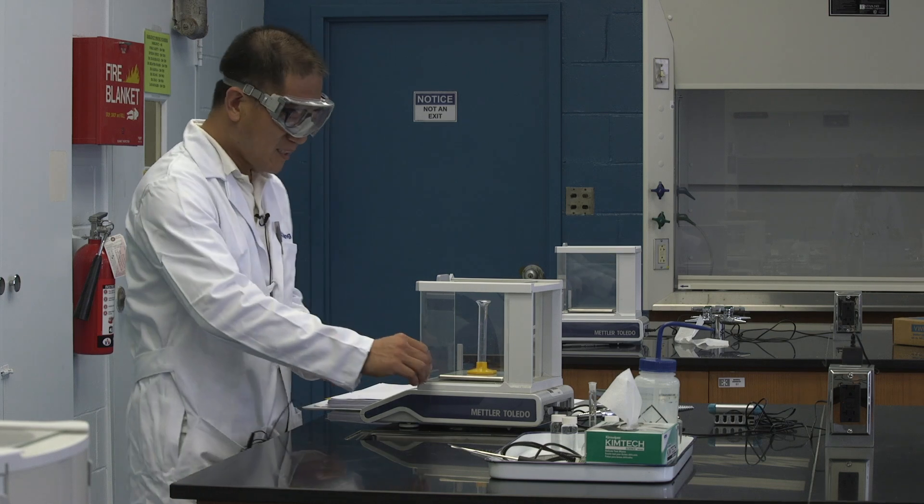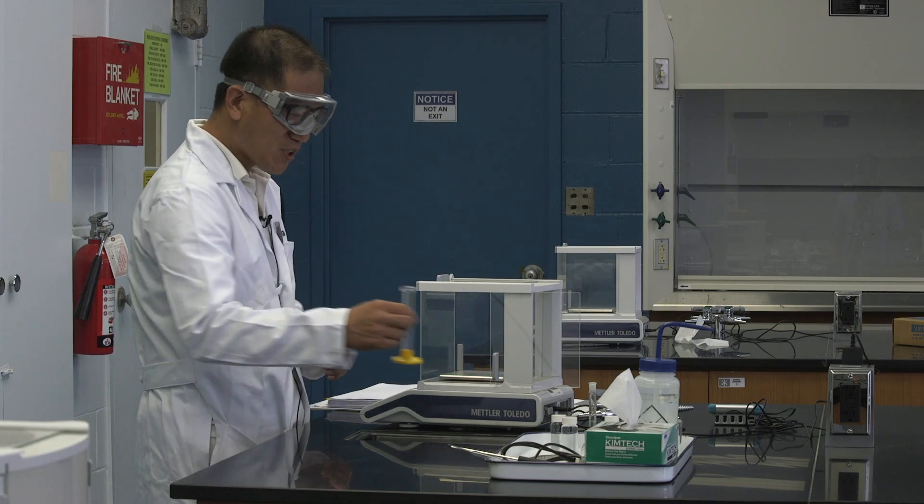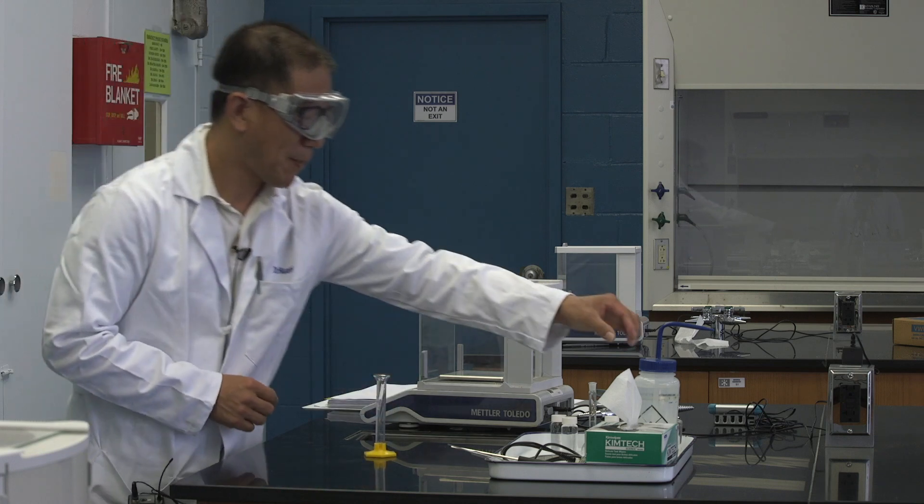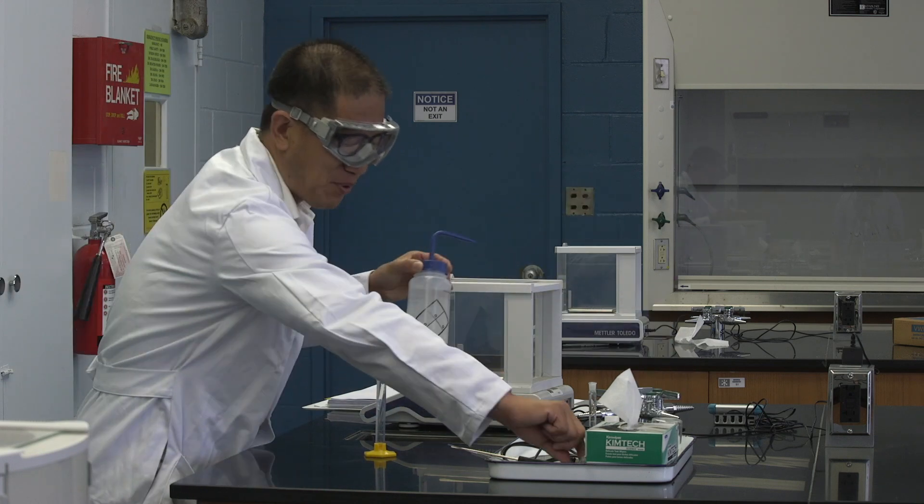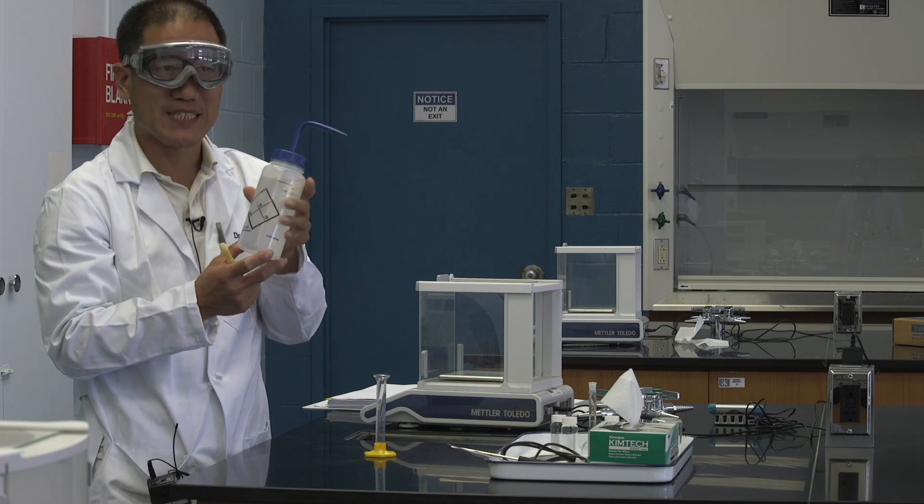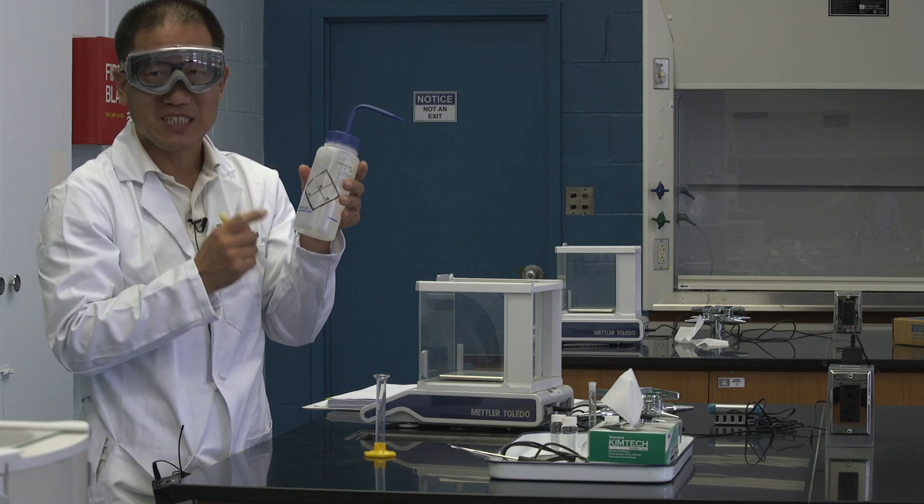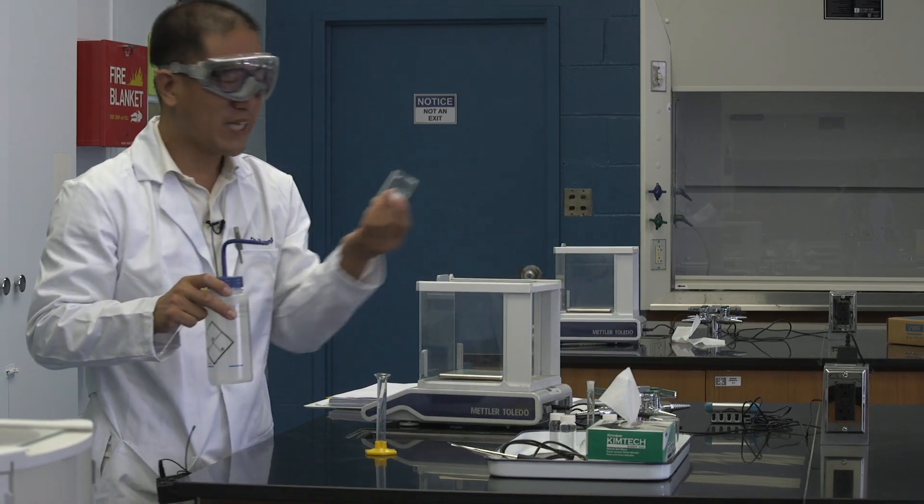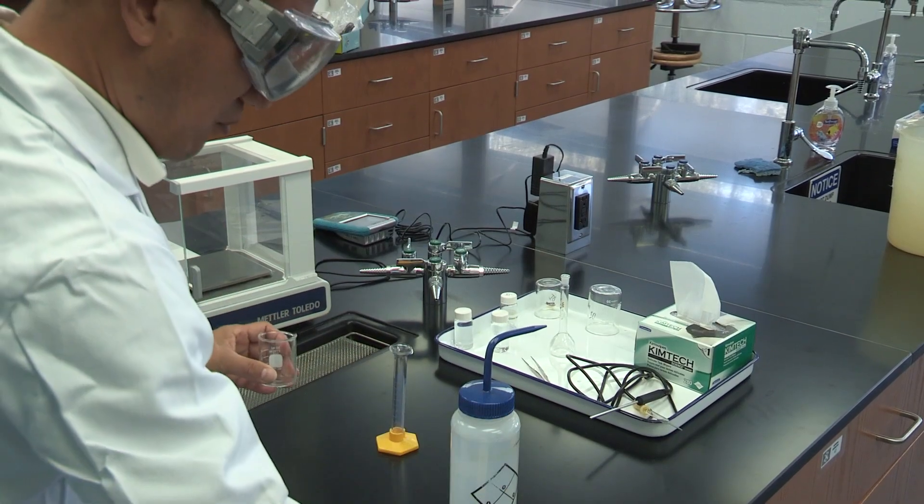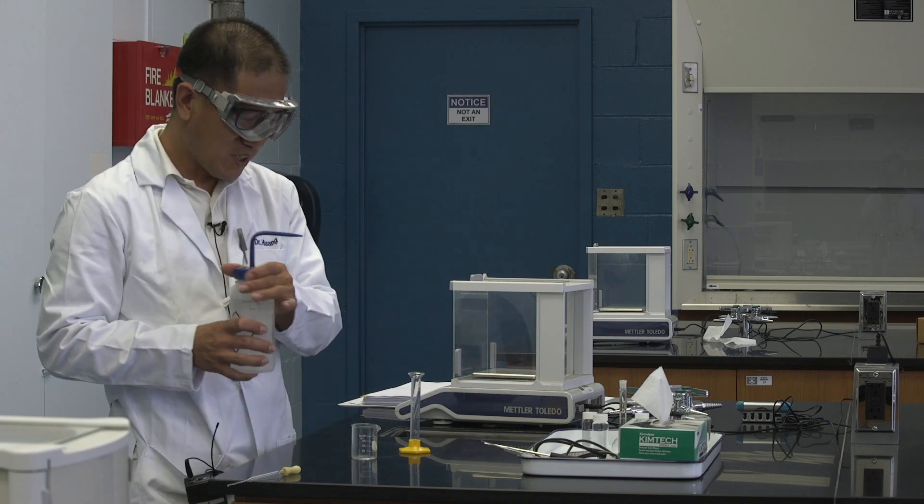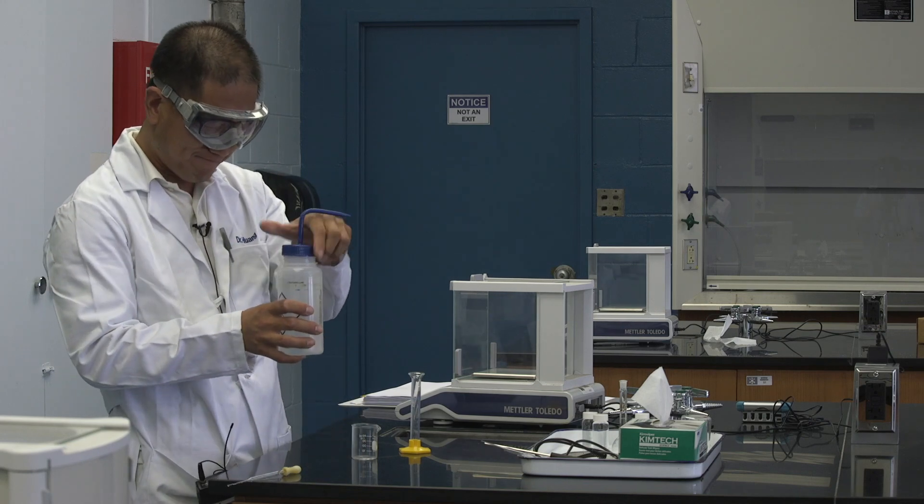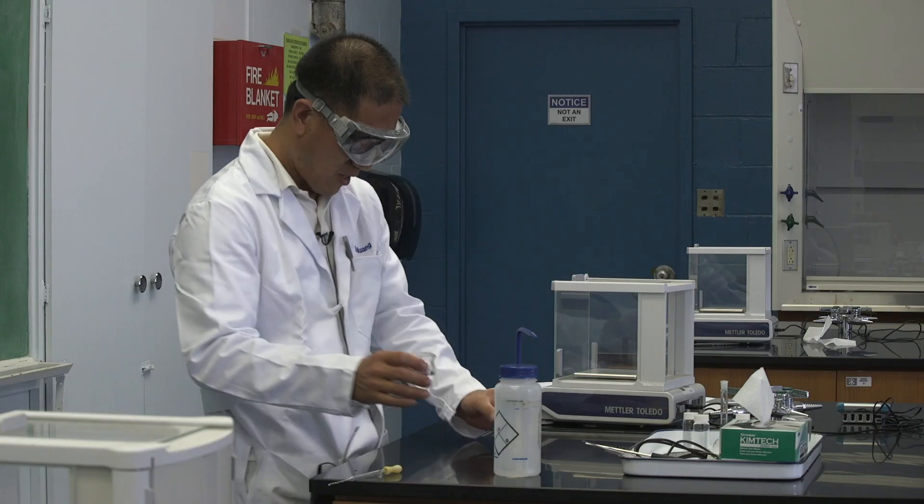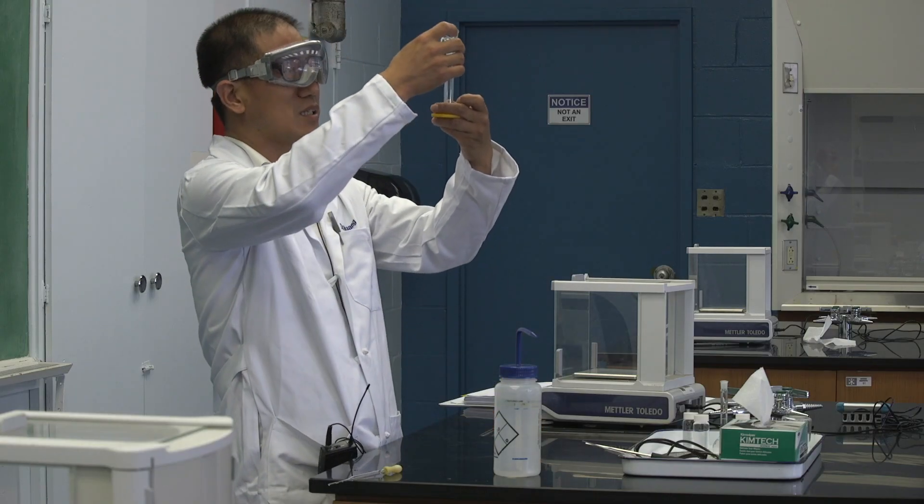Let's take out the graduated cylinder, and we add water to the 2 milliliter mark. We don't want to use the dropper to get water directly from the wash bottle, because if this is dirty, it will contaminate the whole bottle. So we get a beaker. Let's get some water from the wash bottle to the beaker.